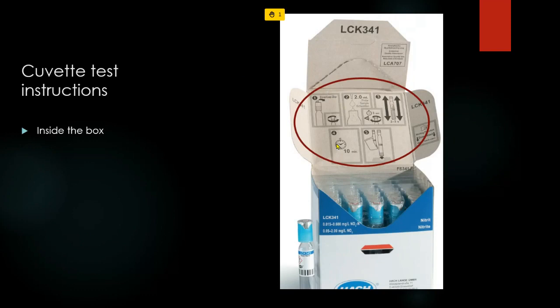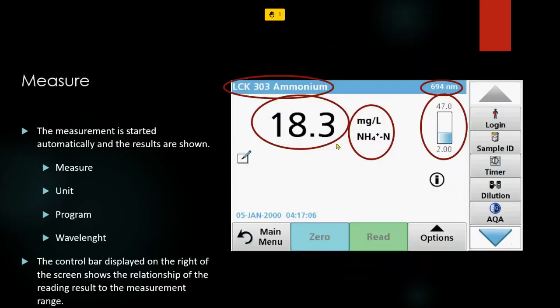One more question. Do you take the filtered sample or the sample as is? Do you filter the sample or not? Yes, this depends on the measure.